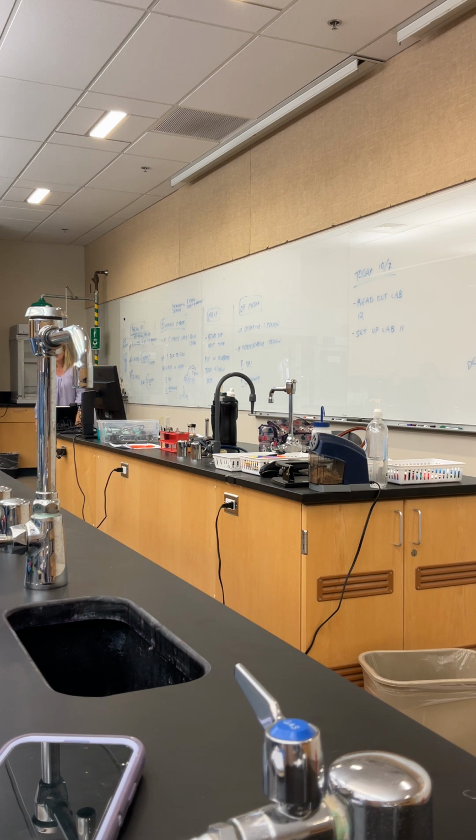So looking at your organism, the negative should be a green color, the positive should be a really pretty blue. That means that I got a CO2 change. I went more basic. Okay, so who is presenting as a pretty blue? E. aerogenes. Good. E. aerogenes should be positive. E. coli should be negative.